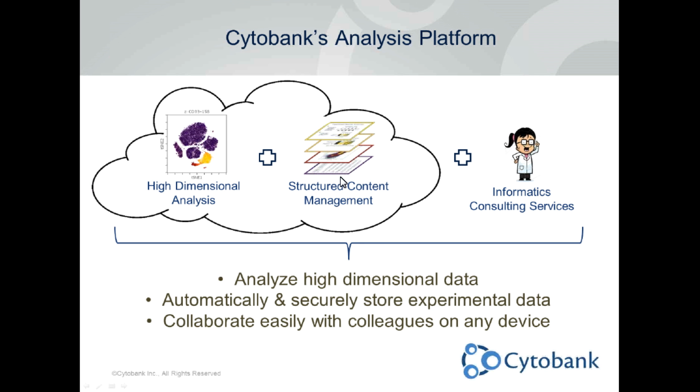So outside of our software offering, though, we also have an informatics consulting group. So at Cytobank, this is a group that does bespoke analysis. So if you have a large data set or are planning a large clinical trial, please get in touch with us. If you'd like help with that, let us know, and we can talk about it. But today, for this webinar, I'll be talking mostly about drop.